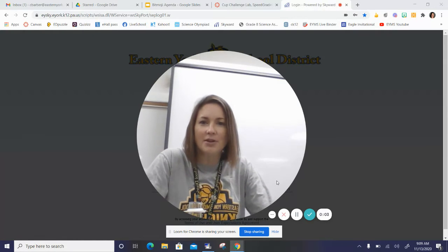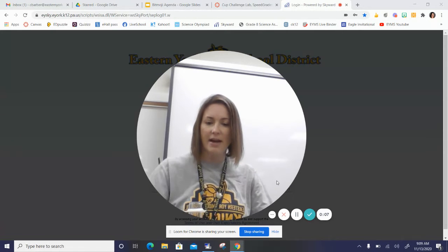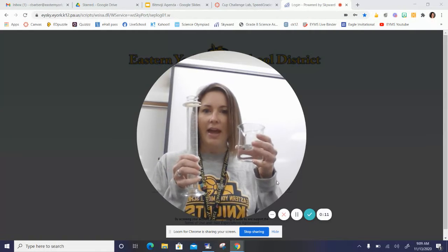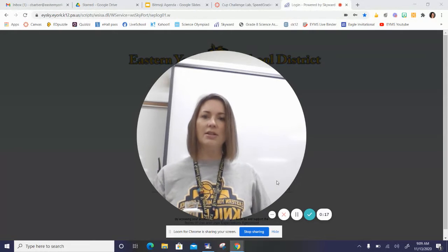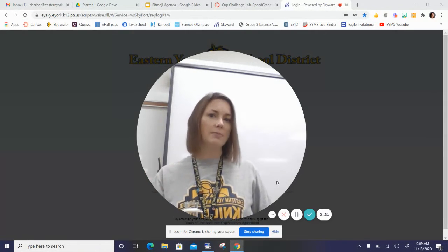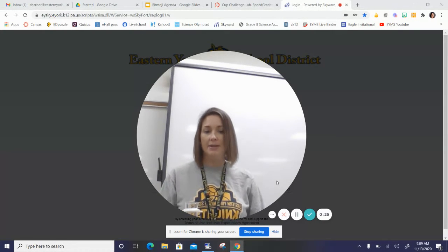Today I'm going to talk about the science equipment that you would be using here in the science lab, the graduated cylinder and the beaker, and the difference between the two and which one is more accurate and why. So you still need to understand which one can offer the more accurate measurement reading and be able to support why or explain why that is.